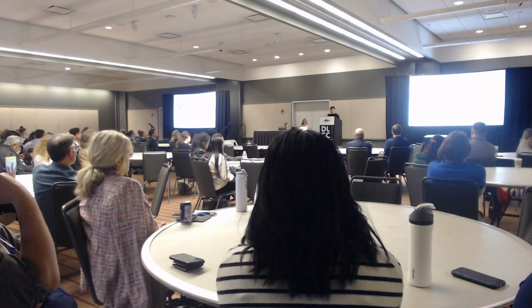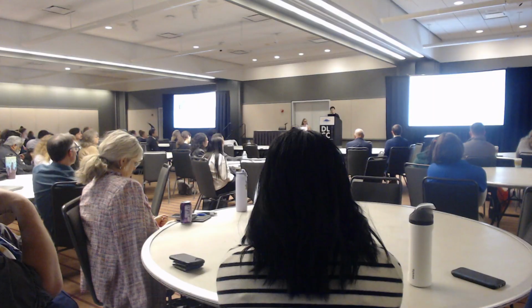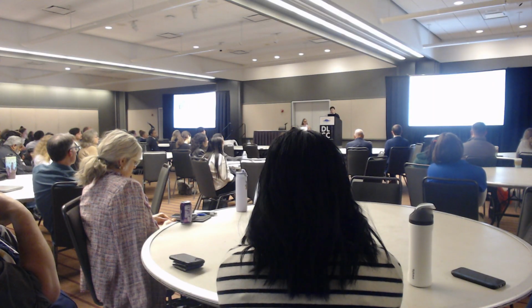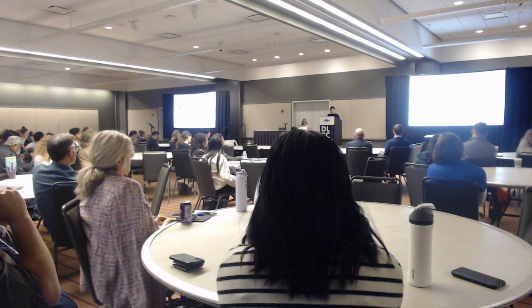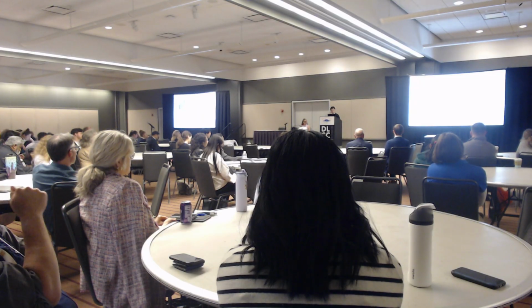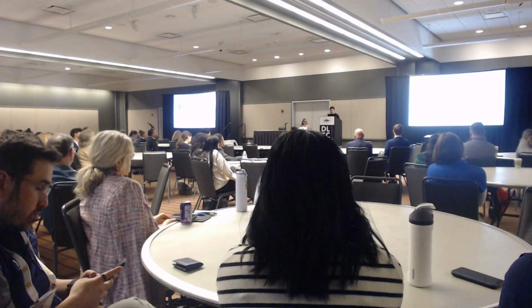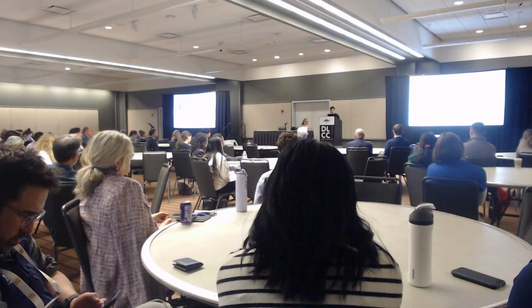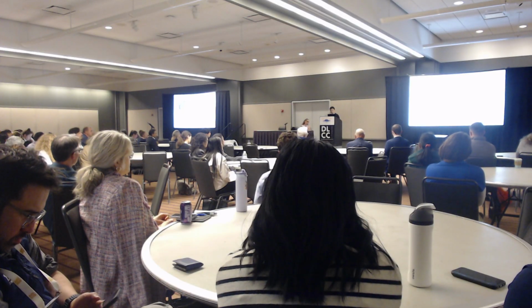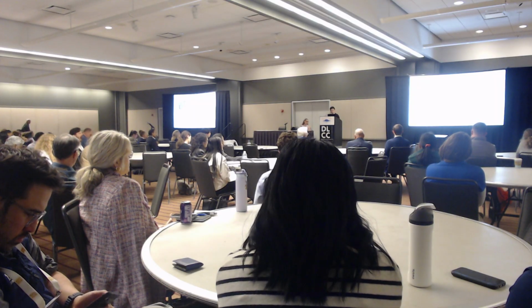So we first tested the feasibility of this protocol on the mouse brain, and the spatial clustering looks very good, which can differentiate the cerebellum, different regions of the cerebellum, and the hippocampal region. And then we checked the signals or marker gene activities between two biological replicates, which showed a very high spatial specificity, and also they are reproducible.